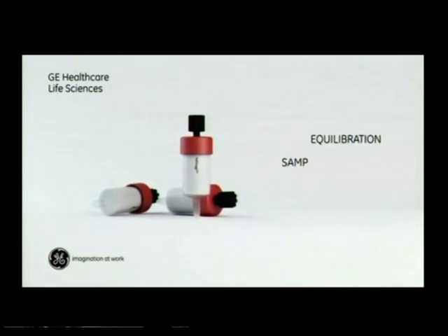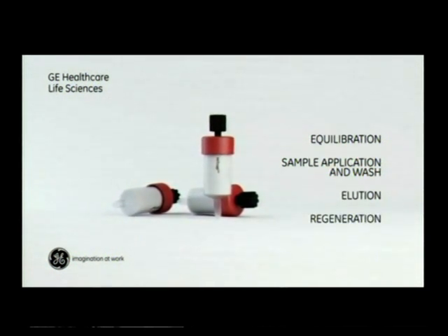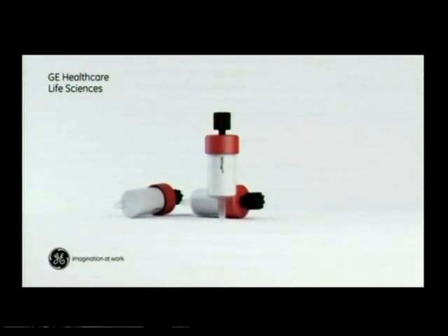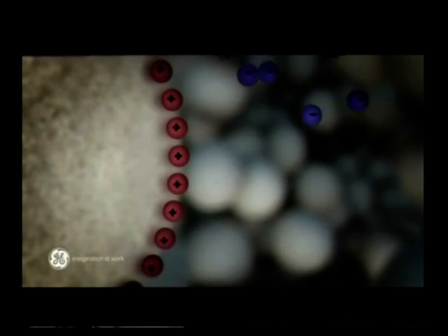We use four main stages: equilibration, sample application and wash, elution, and regeneration. These are resins which are present in ion exchangers.